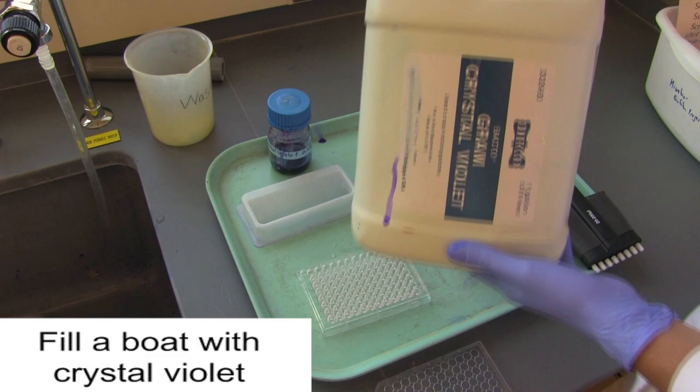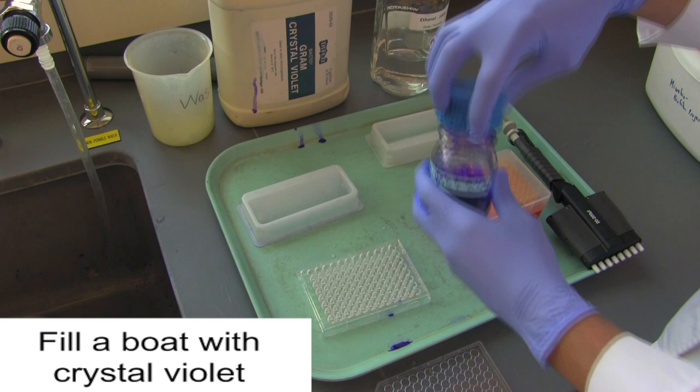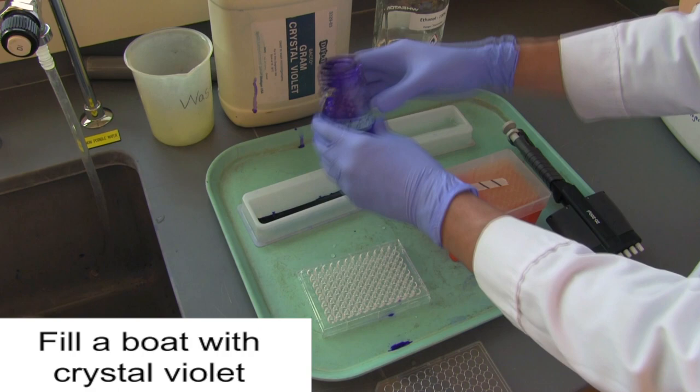Now, you'll fill one of the boats with crystal violet. This will be used to stain the cells in the biofilm.